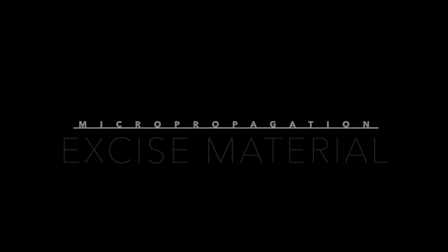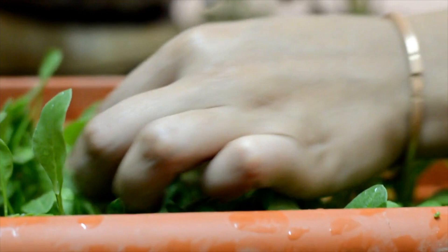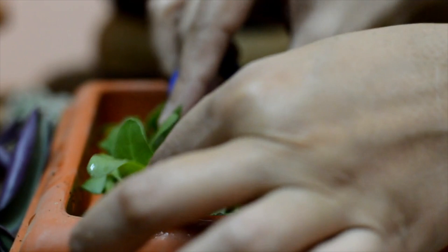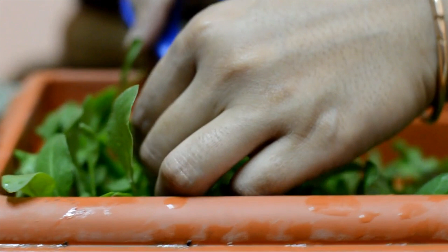When it comes to my job, most of what I do is tissue culture — excising the material. I begin by gathering plant material from some of the plants we have sitting around. This is primarily a cannabis facility, but right now we're pending our licensing, so I'm going to practice on some non-cannabis plants. I'm going to use Roma tomatoes and Cherokee purple tomatoes, as well as bell peppers and shishito peppers.